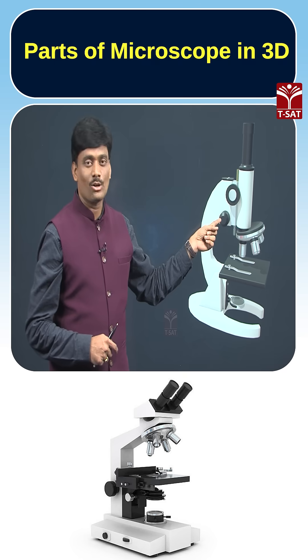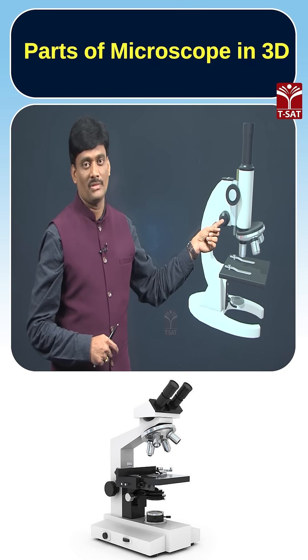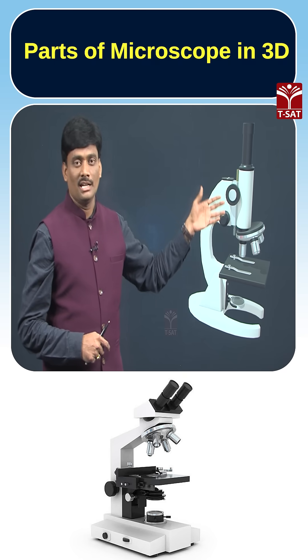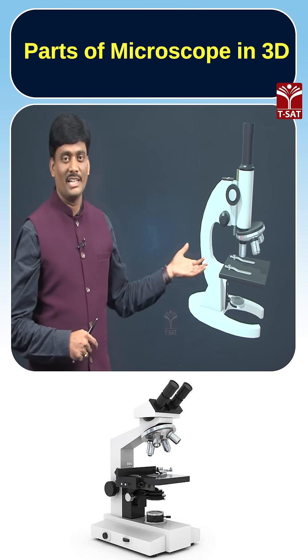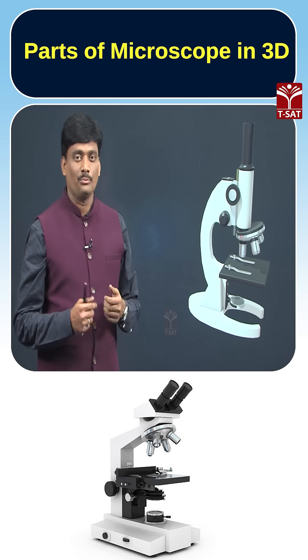The lower one is called the fine adjustment knob. These are the major parts present in a microscope.